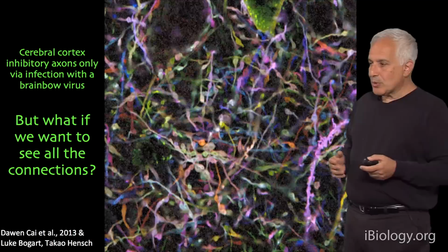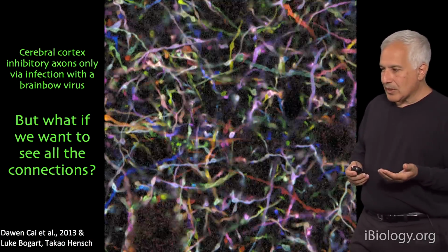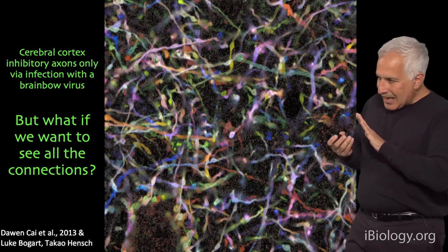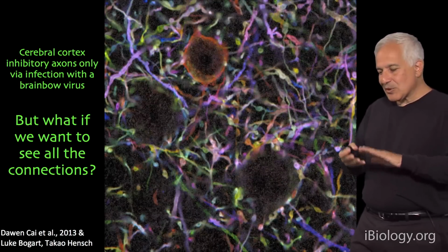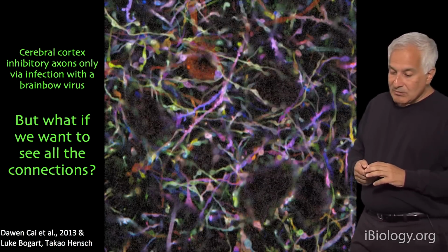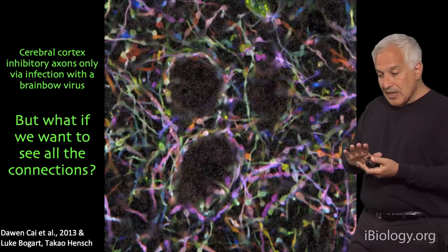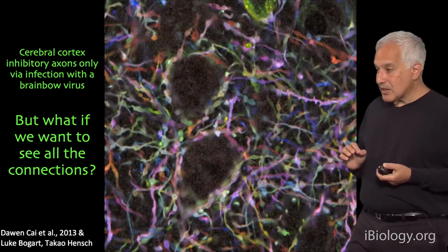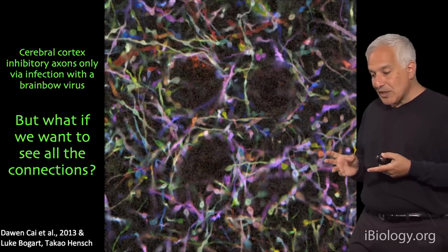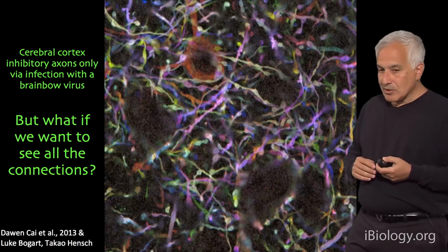But what if we really want to see all the connections? And for many of the questions I am interested in personally, I really need to see all the connections. And that requires going to techniques that allow us to cut brains thin enough that every single section is unambiguous from the section in front and the section in back. When you use a confocal microscope, there's not much you can do below about three-quarters of a micron. Things that are within 750 nanometers of each other tend to be in the same focal plane, and that becomes very hard to disambiguate one thing from another. But if you could cut brains thinner than that, and I'm thinking about cutting brains not at 750 nanometers, but 30 nanometers, then every wire is in its own section, basically, and that makes the reconstruction much better.